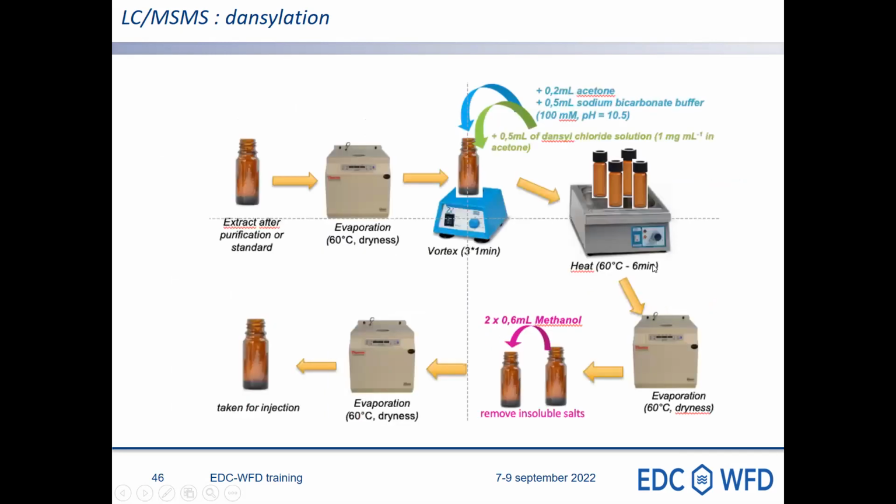And here you have the optimized protocol we have implemented, so you can also take it and implement it at home. It will work, and you just have to be cautious with the conditions of the dansylation. You should really fix them, and if you fix them, it will be okay. We have made some tests in complex matrix, and we have demonstrated that the ratio of dansylation stays stable even in complex matrix. So it's okay, it works.